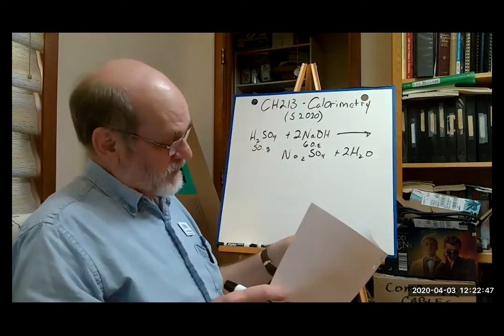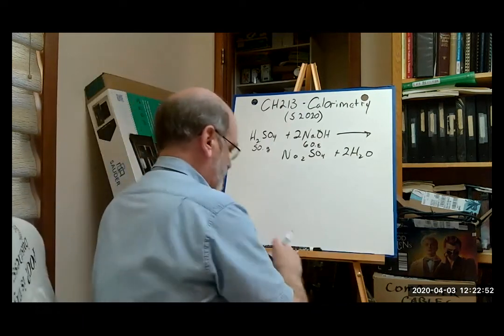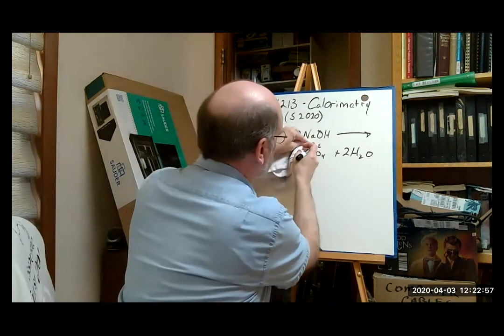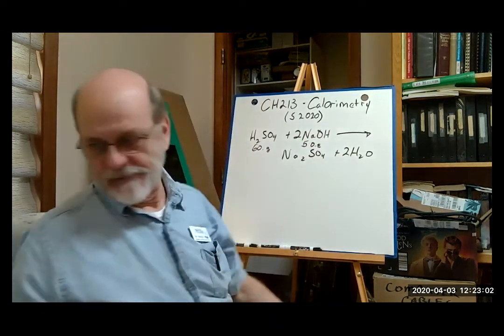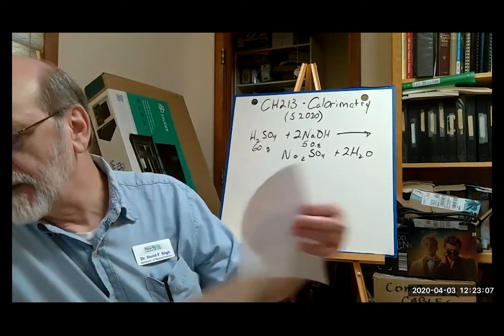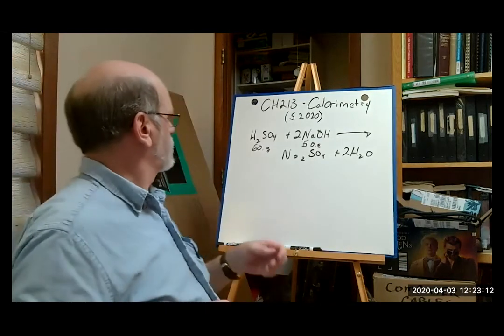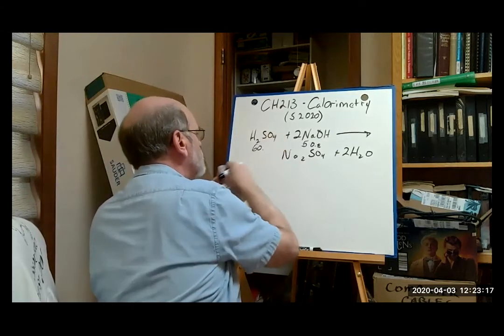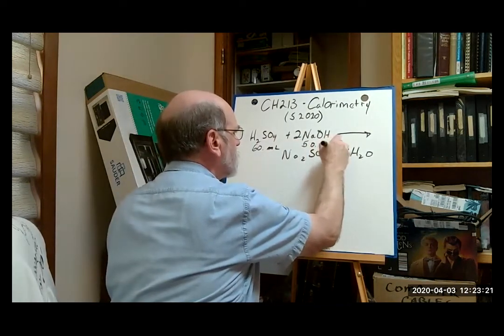No, it's the other way around. It's 60 acid and 50 base. Actually, that's water. Actually, it's 60 milliliters.